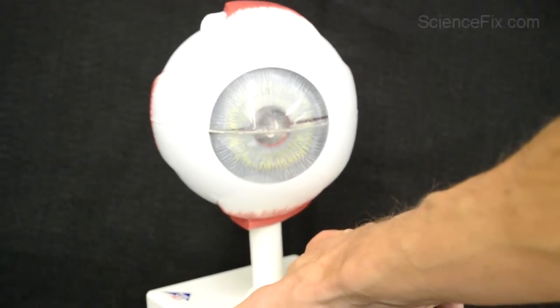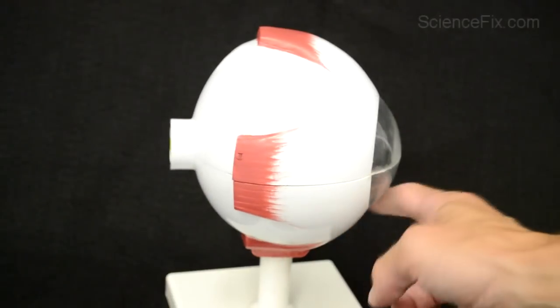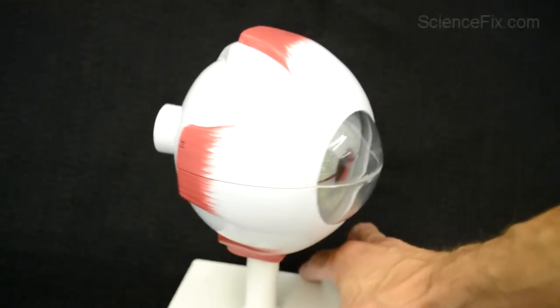And if it gets damaged, light has a hard time passing through it, through the pupil and into your retina, so a person cannot see very clearly.